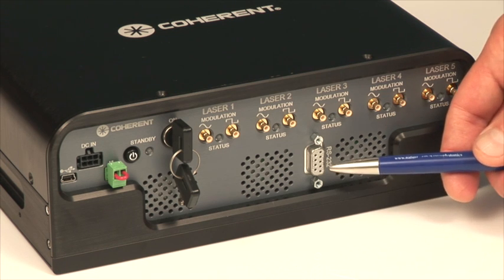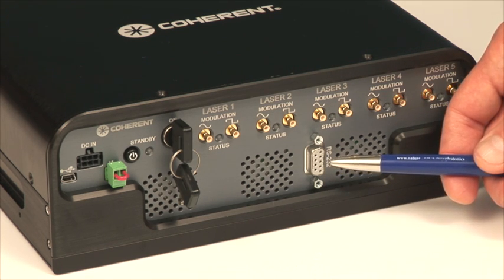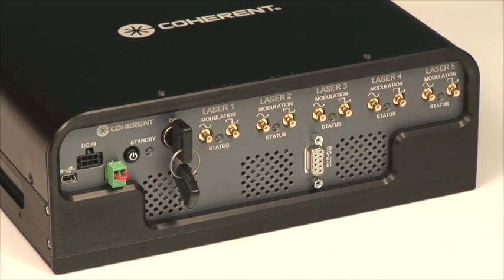There is also an RS-232 connector that you can run to your host computer, allowing each laser to be addressed and commanded separately through RS-232.